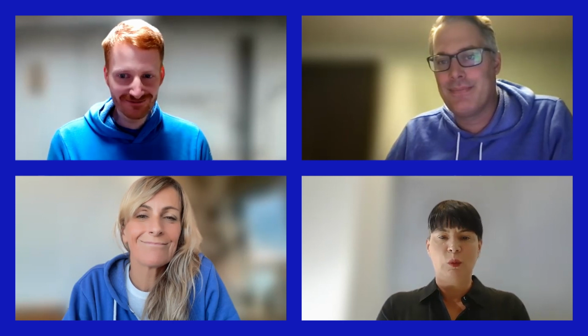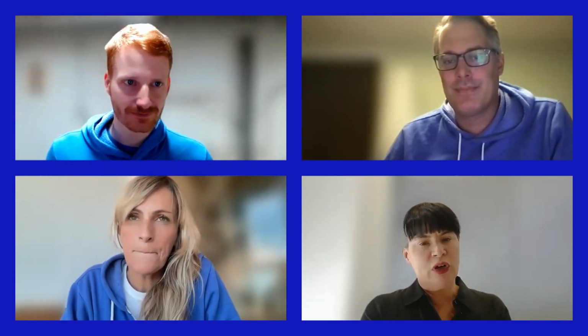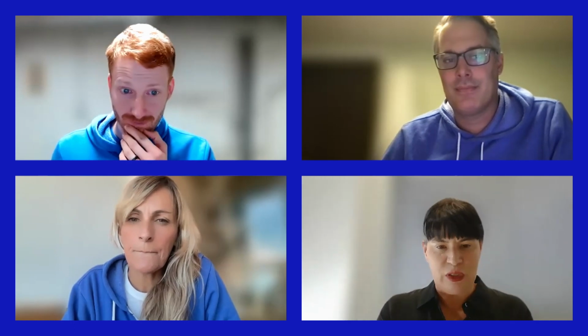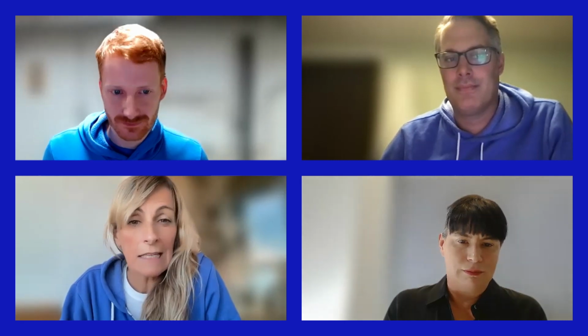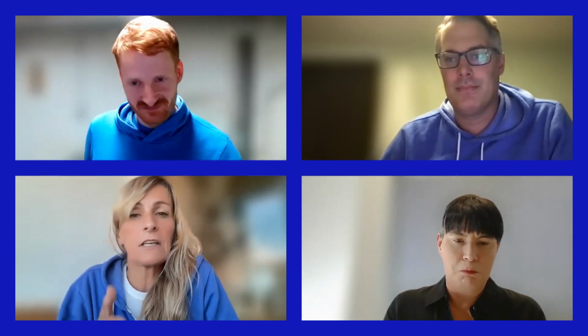Cool. Wendy, one for you. What is the max number of workflow tasks that can be created from a single task? Oh, that's an interesting question. So really a single task can be used in as many workflows as you want to. A single task is configured as an independent unit with its inputs and outputs. So yeah, you can either include it in a multiple task workflow or even use it as a single task workflow.